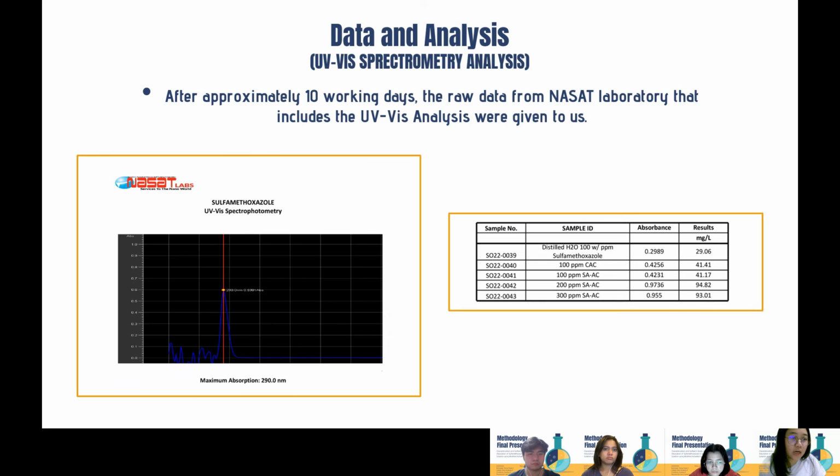The data for the absorption capacity of both commercial activated carbon and sulfuric acid modified activated carbon is also shown in the table. Overall, the results indicate that there is again little to no difference between the absorption capacity of the two. This leads us to the decision to redo the experiment. To further explain, we were able to complete and perform the experiment right on our indicated schedule. However, the results we got are somehow undesirable, and we are considering giving the experiment a try once again.